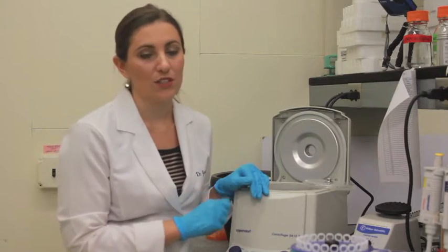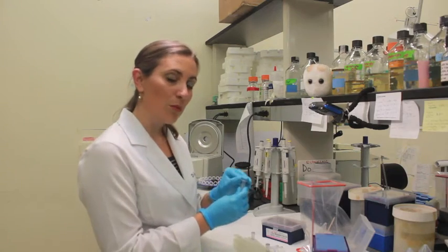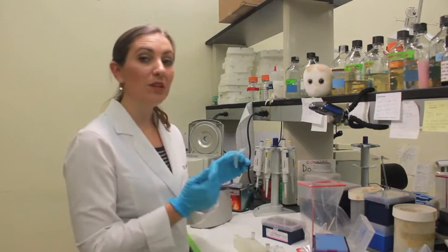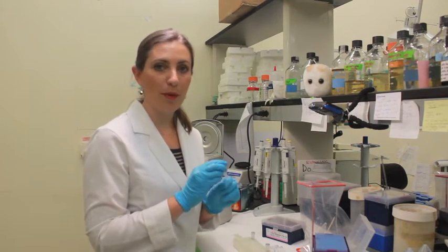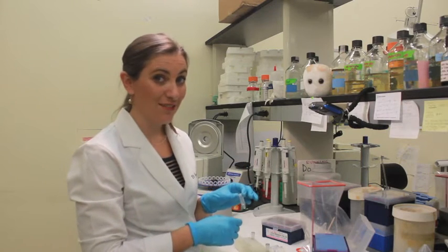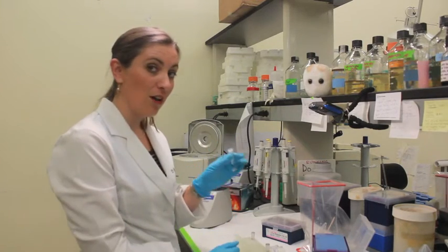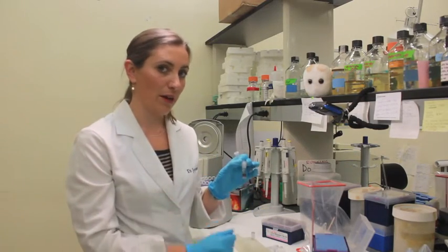From that point, we can transfer it to the extraction kit. When you go to pour off the supernatant, you do it in one fluid motion. There will be liquid remaining behind, so close the tube and vortex the pellet and remaining liquid to create a solution. If you don't have a vortex available, simply flick the tube — all we want to do is break up that pellet into the remaining liquid. We will transfer all of the liquid with the resuspended pellet into the first step of the MoBio extraction kit.